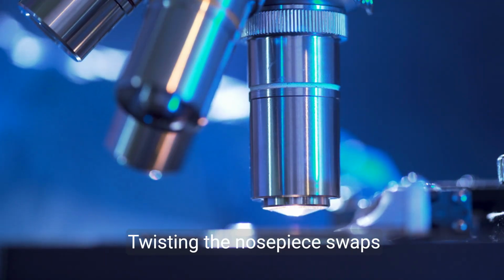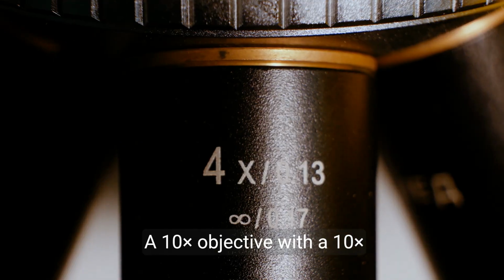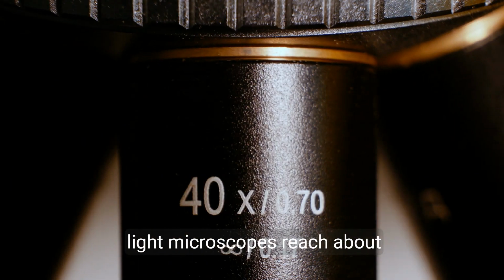Twisting the nosepiece swaps objective lenses, changing magnification. A 10 times objective with a 10 times eyepiece gives 100 times, and some light microscopes reach about 1,000 times.